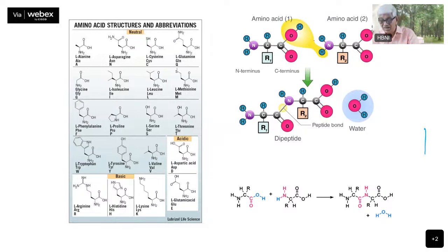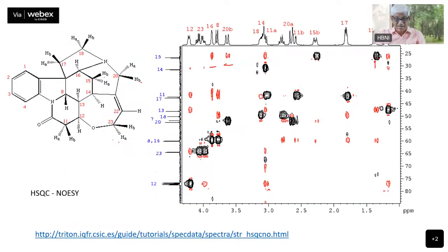You can use blue or green. I will use this color which is not there in your picture. Almost all the colors are pink and yellow. In the previous diagram, when you are putting a dot, the cross peak or your pen will show up there and remain like that. Your original file will not have it, but the recorded one will. I will remove this.